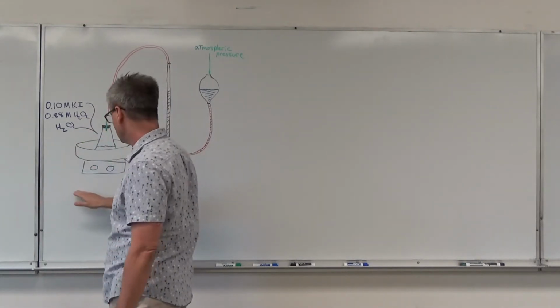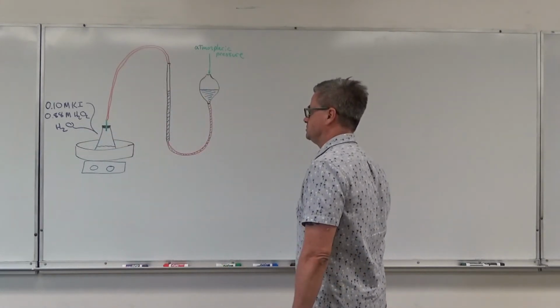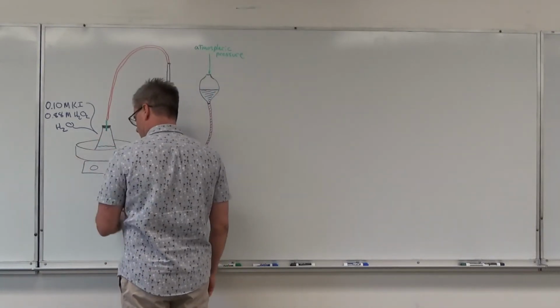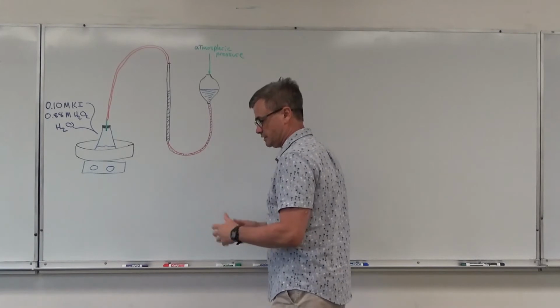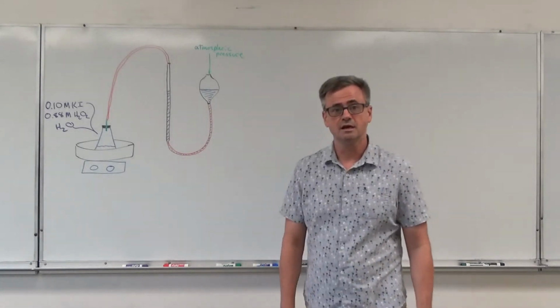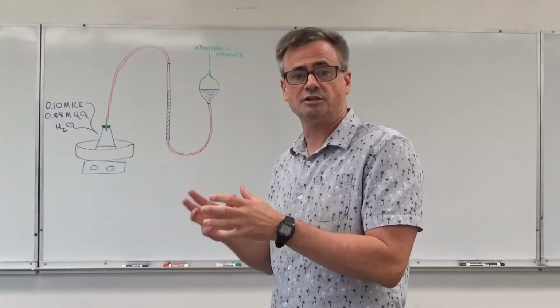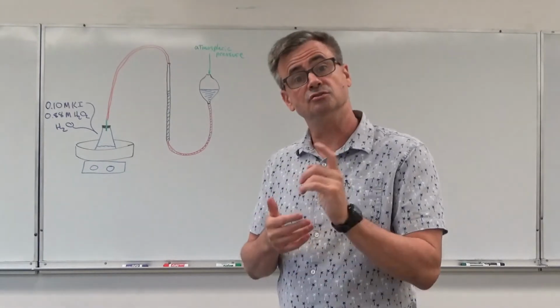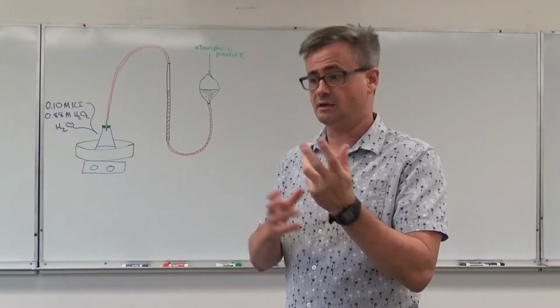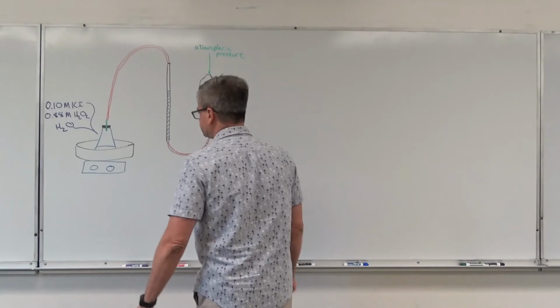It is dropping, right? We know that over time its concentration will drop because it's being turned into oxygen and water. So we want to be able to describe how it's changing, but we need some way to monitor it. Well, we're going to monitor it indirectly, through carefully seeing how much oxygen we create, and then using the stoichiometry of that equation to decide how much hydrogen peroxide was consumed in a given time interval.